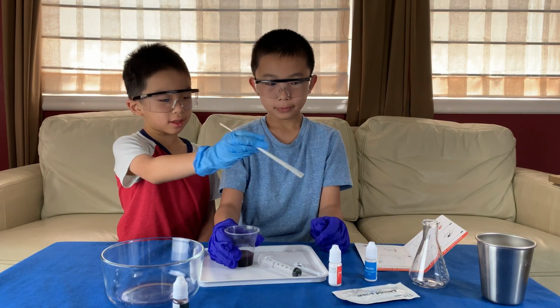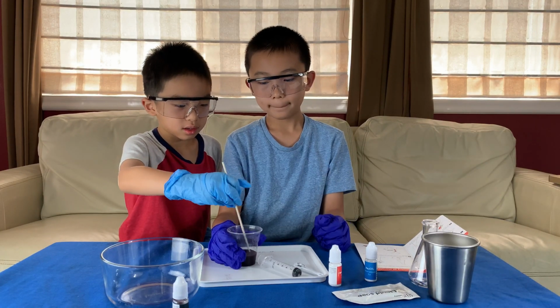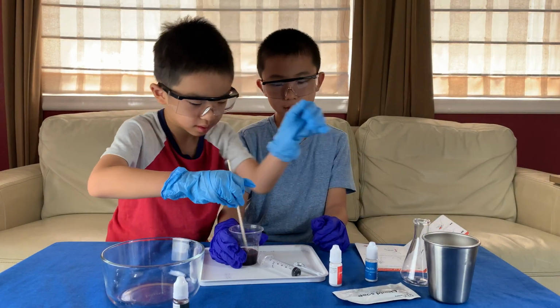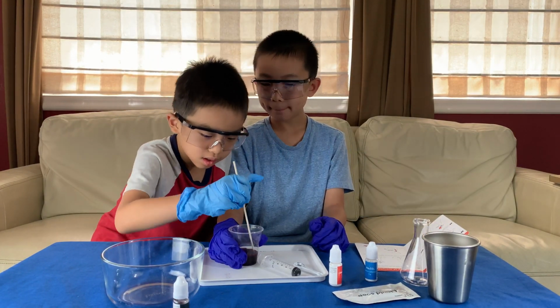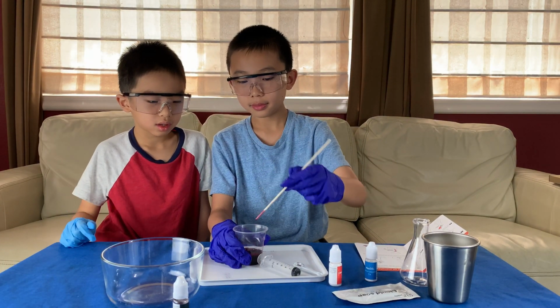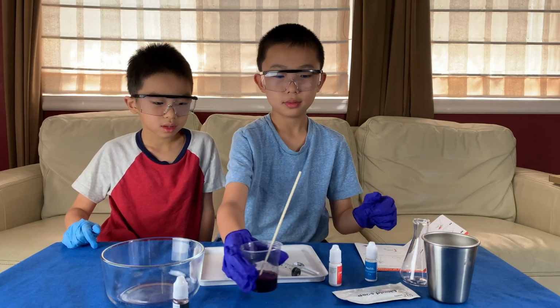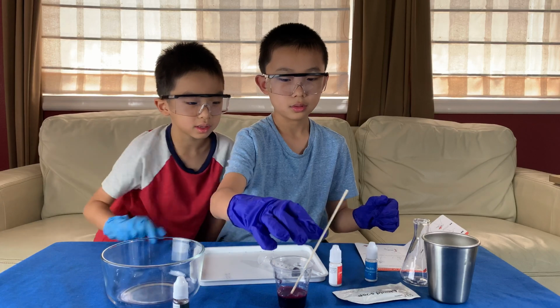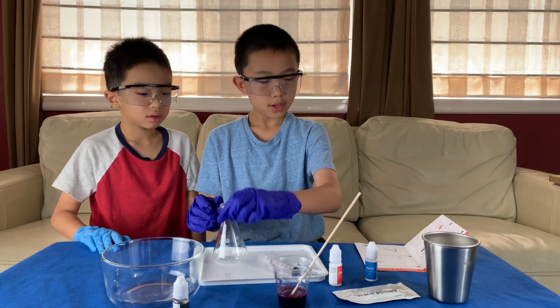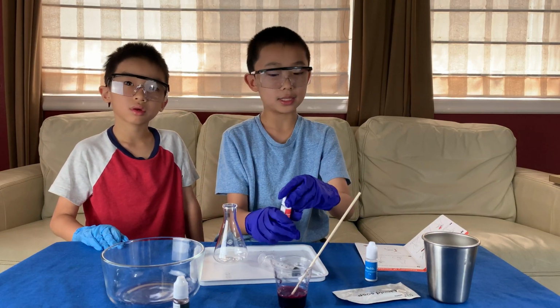Don't put the water on the side of the table. Make sure it doesn't splash. Okay, got it? Okay, I'll just set this aside. Hey, it might fall. A stick might make it fall, I think. It should be fine. And then we need 1 bottle of citric acid in here. It's just the whole bottle.